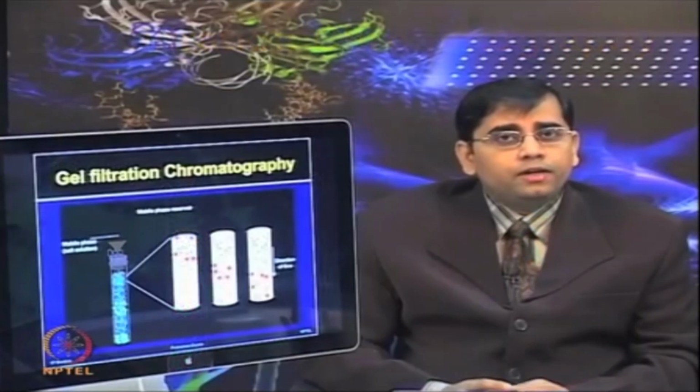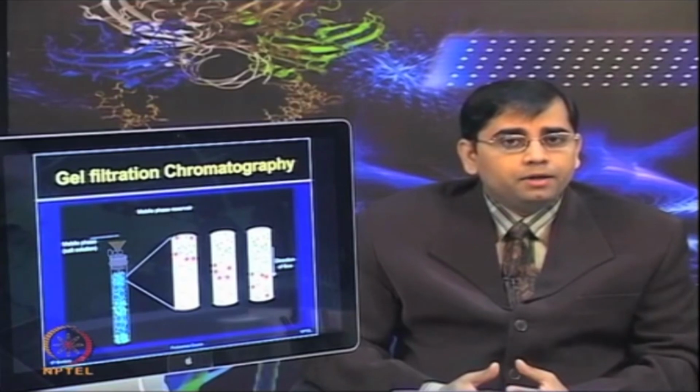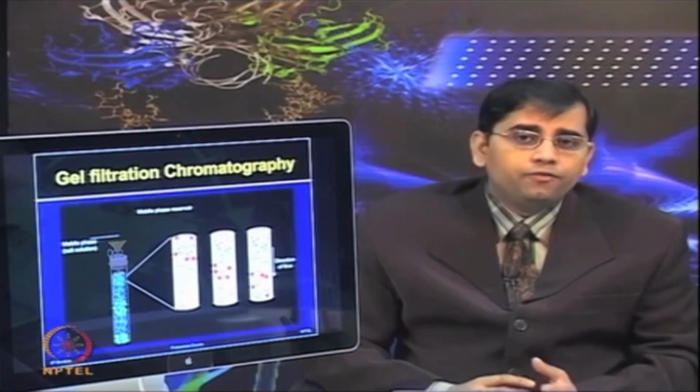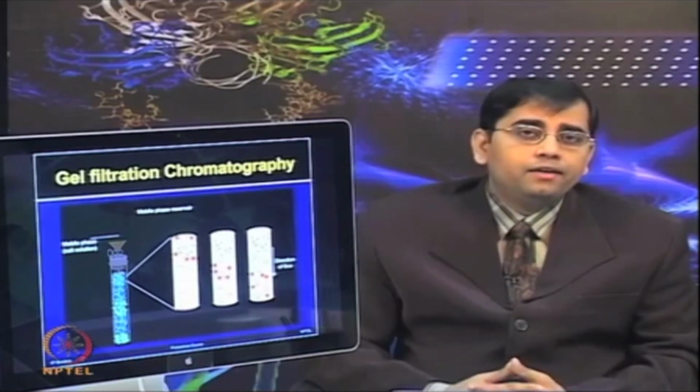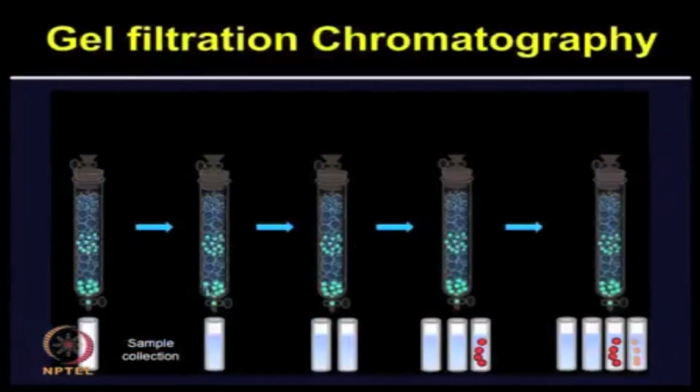Beads of different pore sizes, increased column length for greater retention time, or a decreased flow rate can be used to achieve higher resolution of proteins. After these steps, the fractions are collected and analyzed for the protein content. So, you can expect that larger proteins will elute first, and then the small molecules will be eluted later.